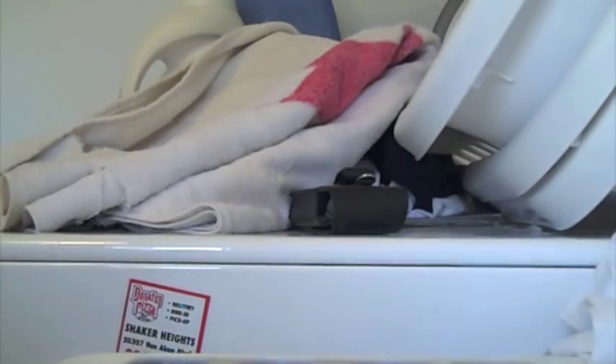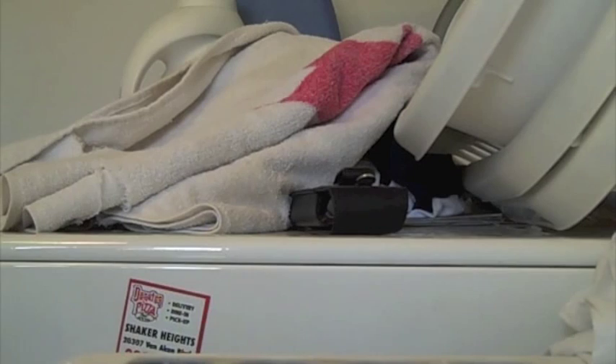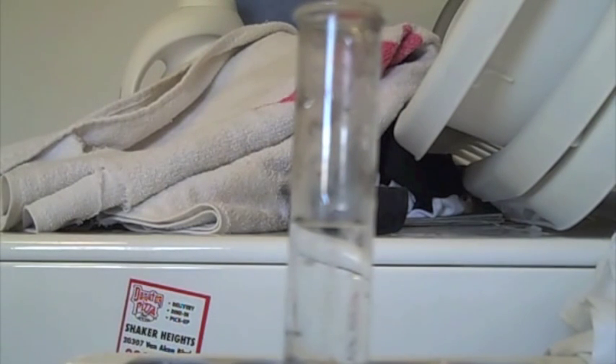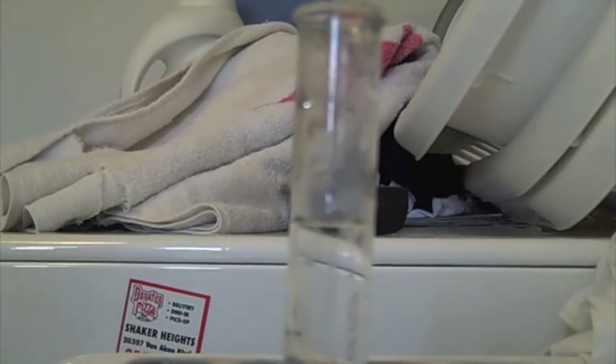First, prepare a solution of ammonium iron sulfate. I'm getting the supplies from my chemistry kit. There's my test tube filled with distilled water, and I'm going to add some crystals of ammonium iron sulfate to it. There's my ammonium iron sulfate and I'm opening it up.